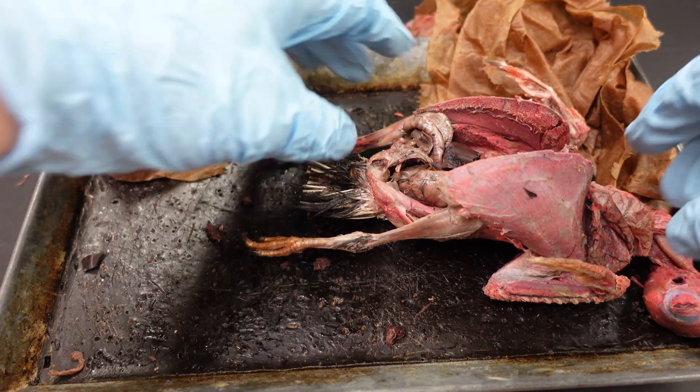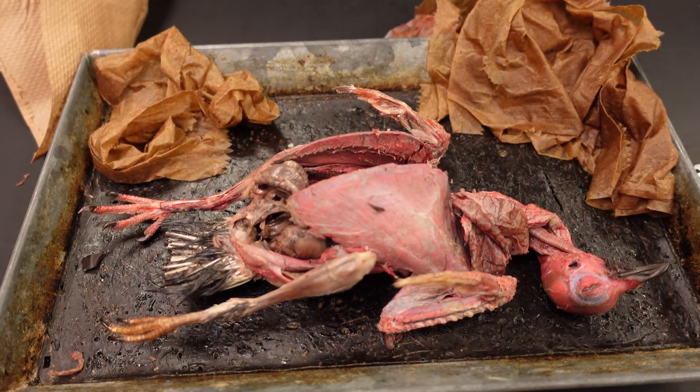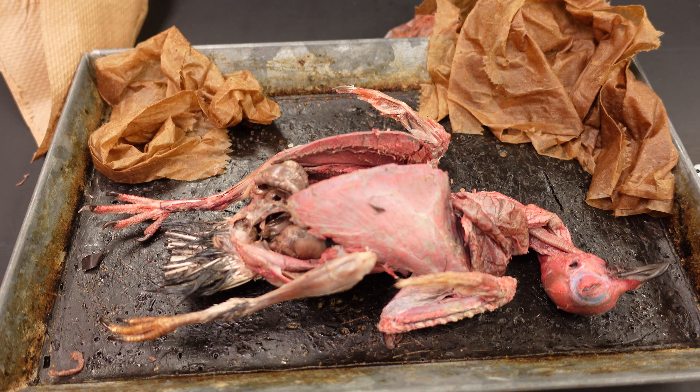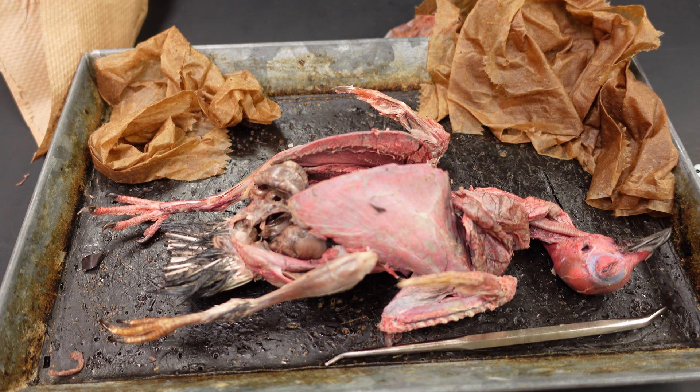The pigeon dissection is done. I did dig out the kidney but didn't narrate over it, so I'll put that information in the text afterward. Take care everyone — see you in lab.